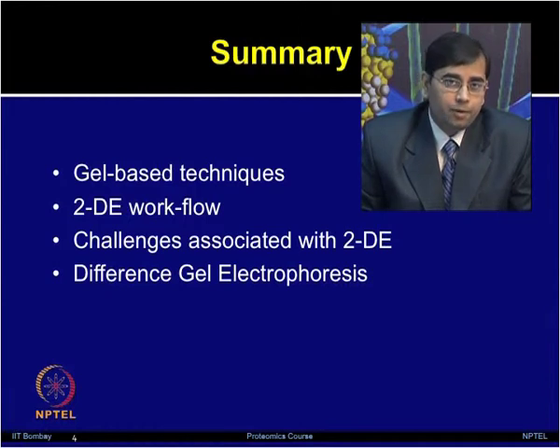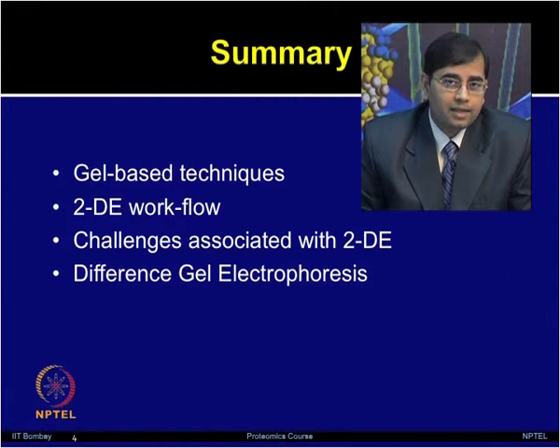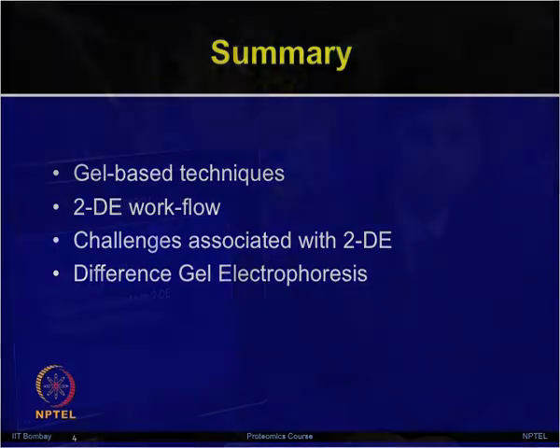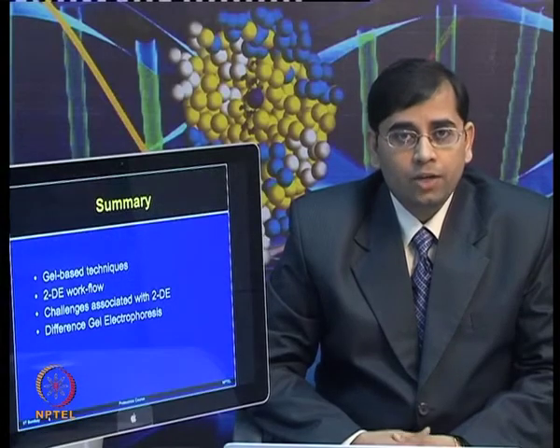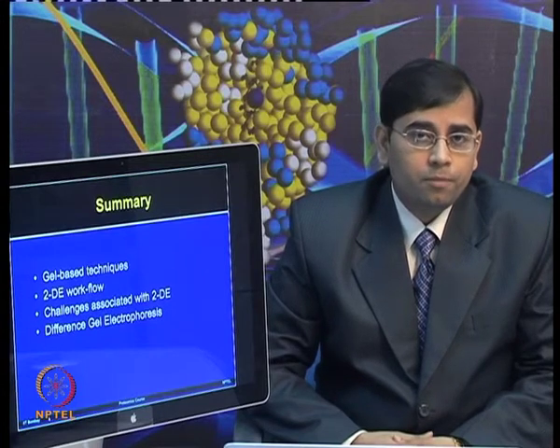Then we discussed different types of challenges for these methods, and I briefly introduced a few creative ways of performing gel based proteomics methods, including off-gel fractionation methods, and then we discussed in much more detail difference gel electrophoresis.